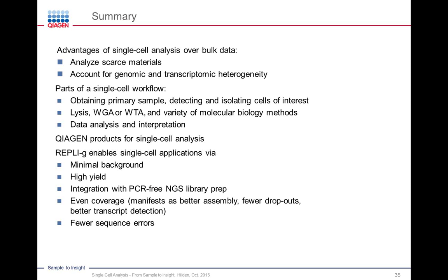So this is a very brief overview, and I haven't been able to impart too much information, but what I hope I've been able to convey is that there are a few reasons that you should be analyzing single cells over bulk samples. The first is very pragmatic. If you only have a single cell, you don't have a choice. This is what you're stuck with. And you can either move on to a new experimental area, or you can put in the extra effort and do a single cell analysis.